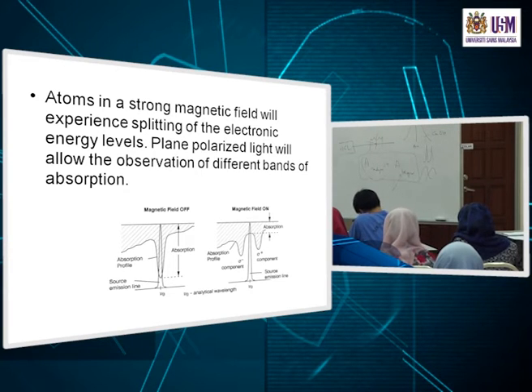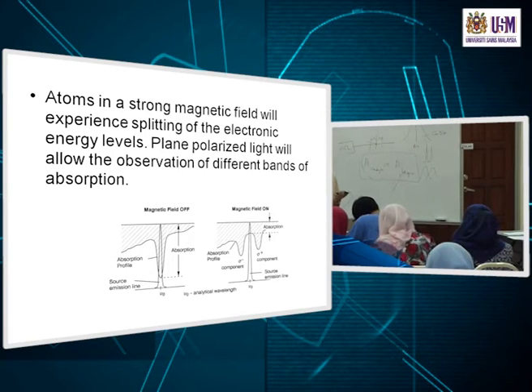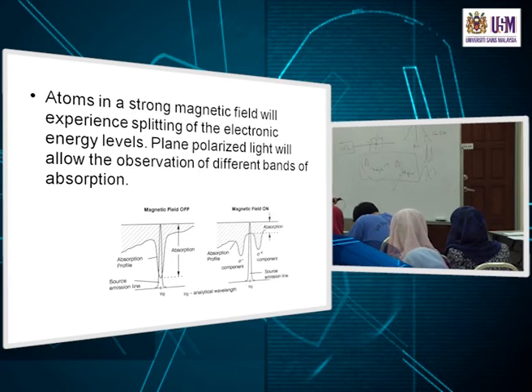Okay, so those are examples of how you overcome background absorbance, and they are called background correction. Okay, and what we said, what was it due to? Scattering of the light in the atomizer, or some molecular absorption by some other species, that you have to subtract from the absorbance readings that you get. So that is the category of spectral interference.